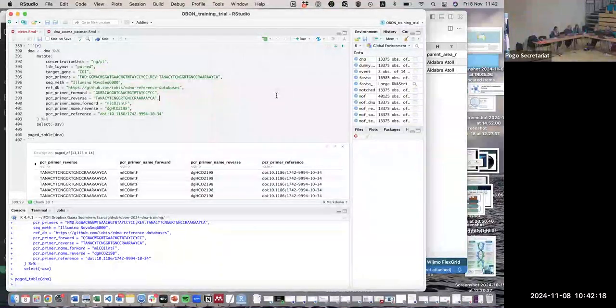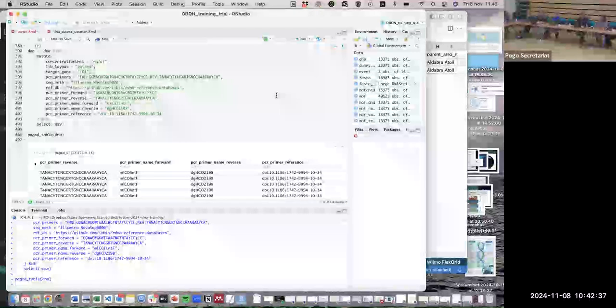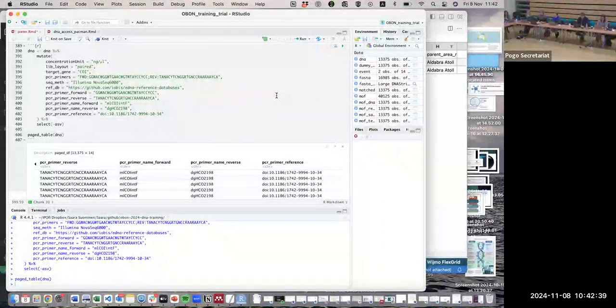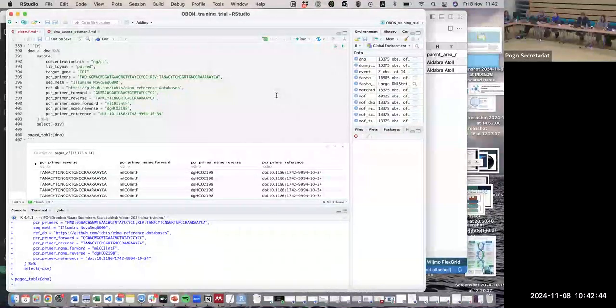So we are using this package called CRABS to extract reference databases from NCBI for a specific biomarker, specific taxonomy. Do you call it crabs? CRABS, it's not our package. There's a very similar one called Crux. It just sounds like it does the same thing. So this one starts with an NCBI text search. That's different, this starts with primer sequences, and then you can do a PCR on those, and then a PGA, and then you add your names, and then so you make a reference database.